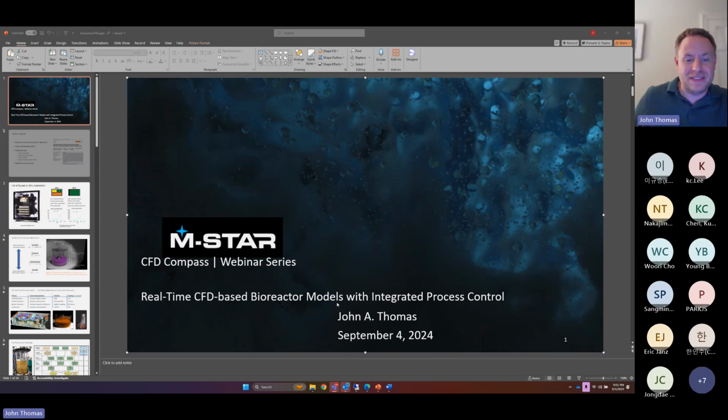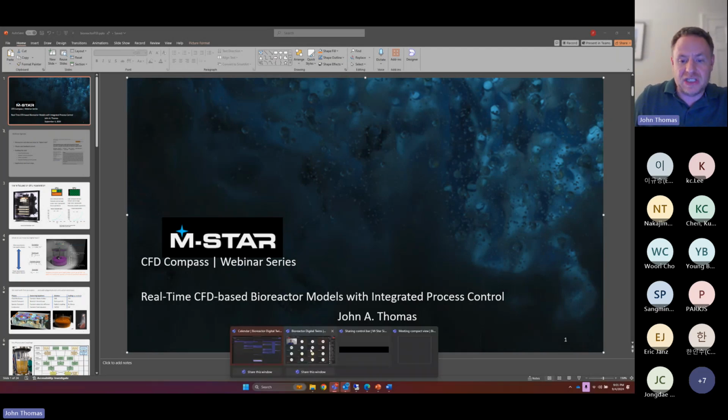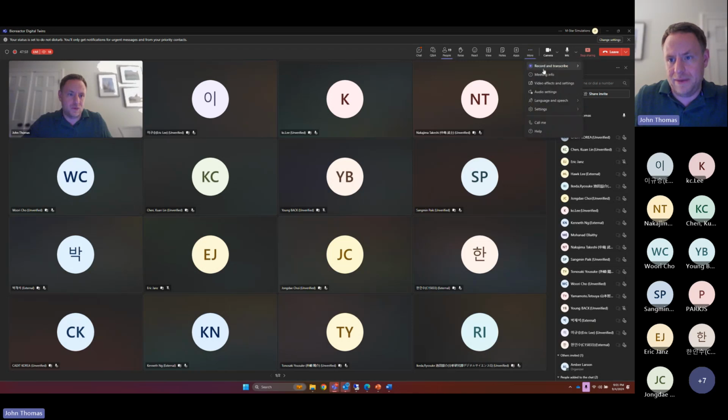Today we'll be speaking about real-time CFD-based bioreactor models with integrated process control. So we're going to be talking a bit about transport physics. We're going to talk about interfacial mass transfer. We're going to talk about blending, and we're going to talk about PID control and biomass and metabolites and all sorts of fun things.